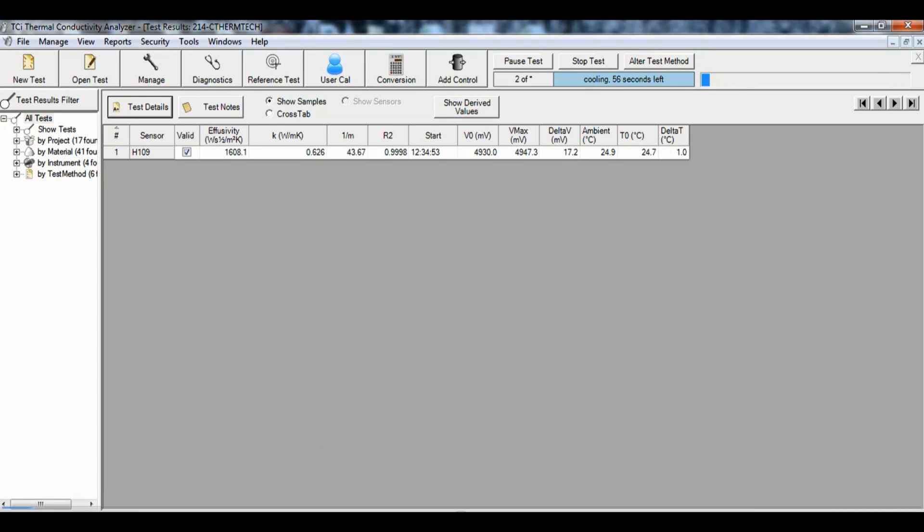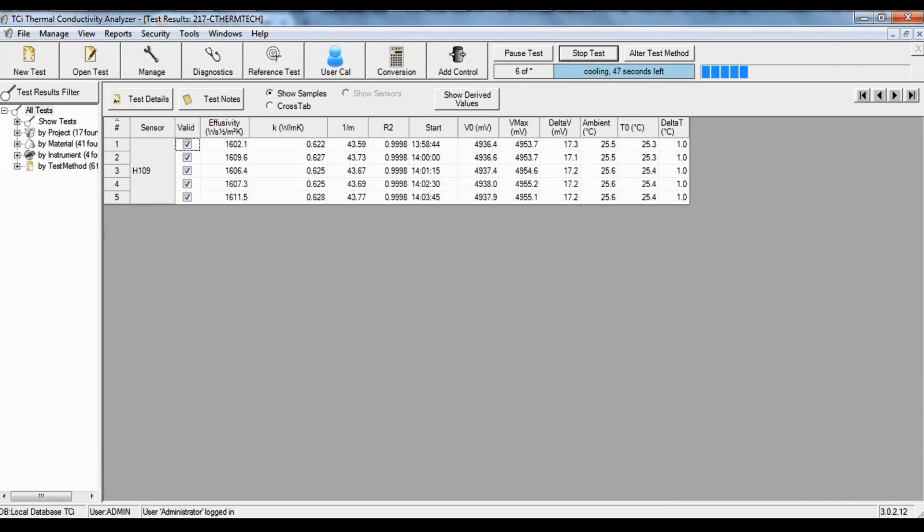And we're able to run as many measurements as we like but typically we would look at doing five measurements back to back.